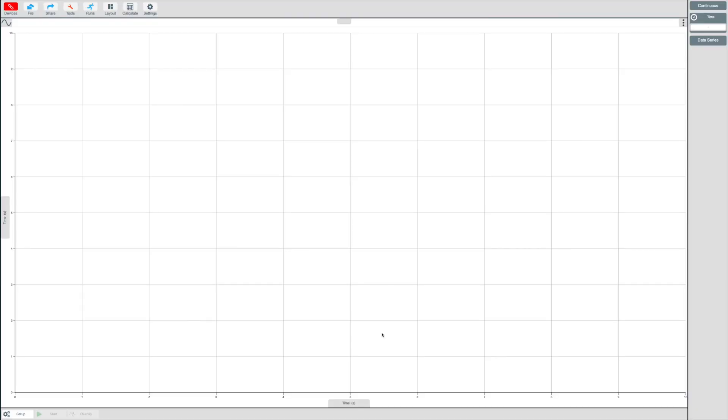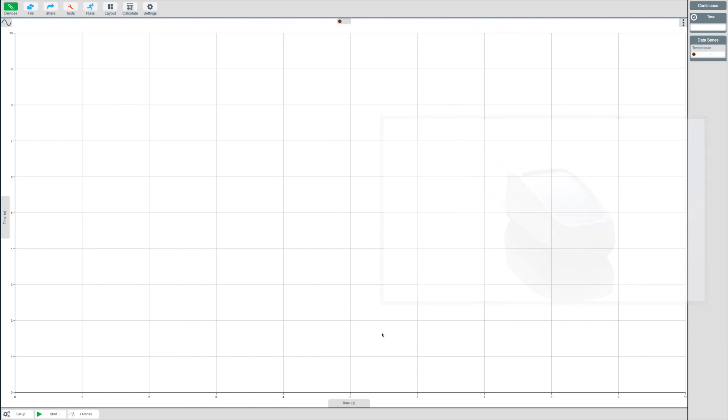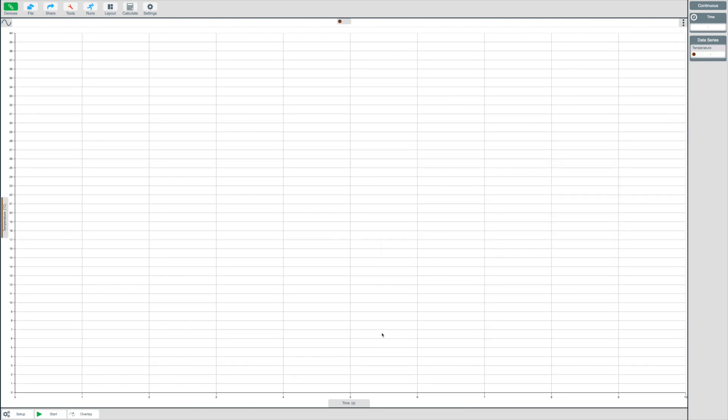To connect a sensor to the EasySense 2 software via USB, plug in the USB lead into the device and the EasySense software will automatically connect.